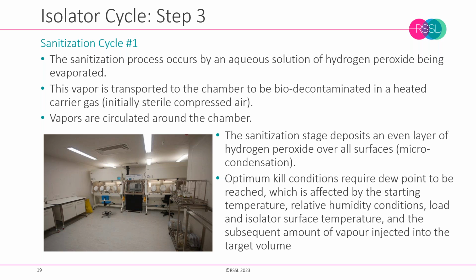And there is obviously debate about the relative efficacy of those two technologies, but most literature indicates that they are fairly identical and appear equally efficacious. There is also on the market ionized hydrogen peroxide, which uses a lower concentration of hydrogen peroxide, so it's sort of down to sort of like 10% concentration.